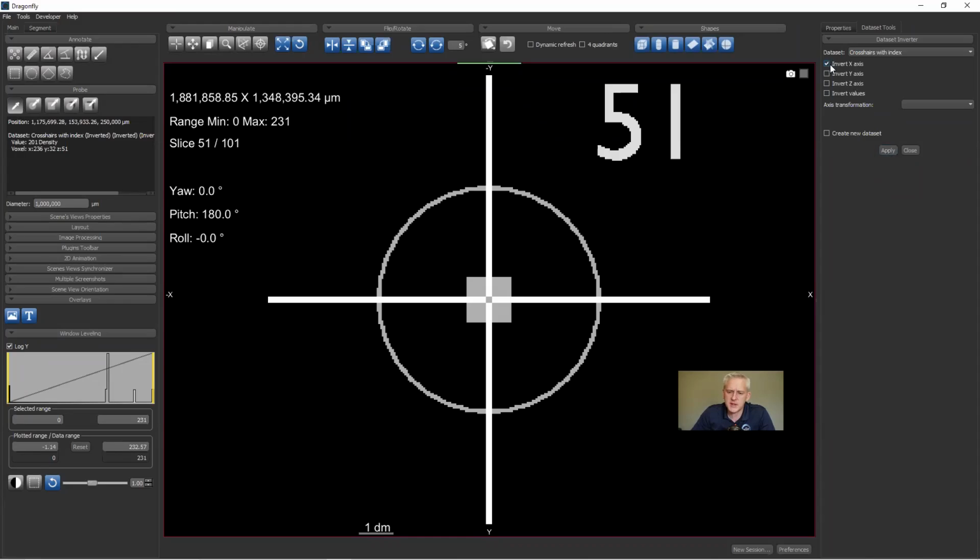The last option here, this is a bit esoteric, but you can do an axis swap. So this pixel right here has a y of 254, and up here it has a y of 6 or 7. This is the y-axis going this way. You could remap that y-axis onto the x-axis, for example. This, again, can be useful when you're trying to register data sets from different image sources. If I wanted to flip the x and y axes, I could choose the y-x-z transform. Sorry, I want y-x-z, and here it is. So if I apply this, then now these pixels that were on the y-axis are now on the x-axis.